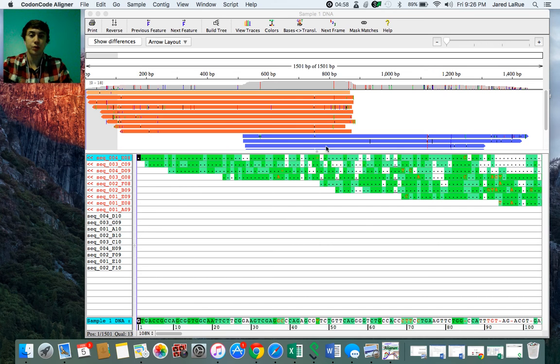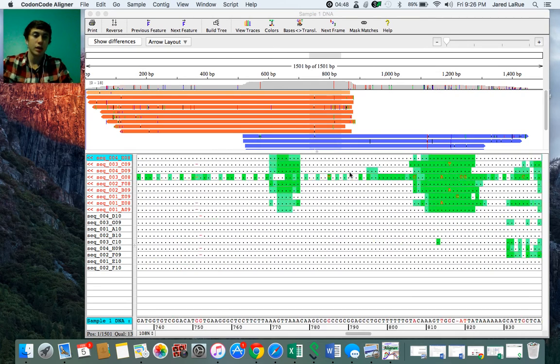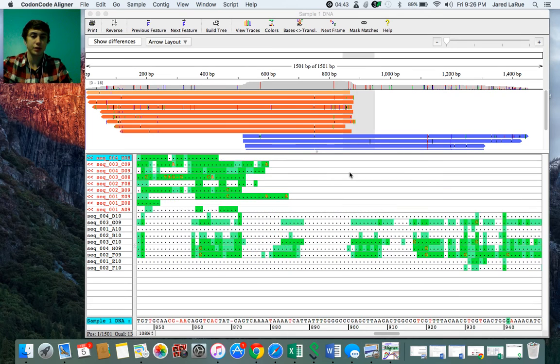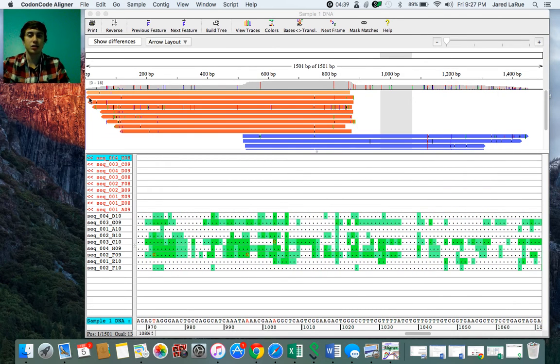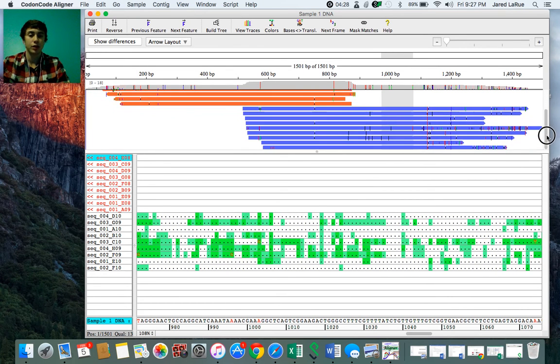And so in this video we're going to show you how to adjust some of your DNA sequence that you have inserted in a Codon Code liner, and just a couple of the neat things that you can do with it. So as you can see here, there's all these different sections of your sample. This is just telling you the directionality. Up here is just showing you the directionality of all of your samples. Kind of gives you a good layout of how they're placed.